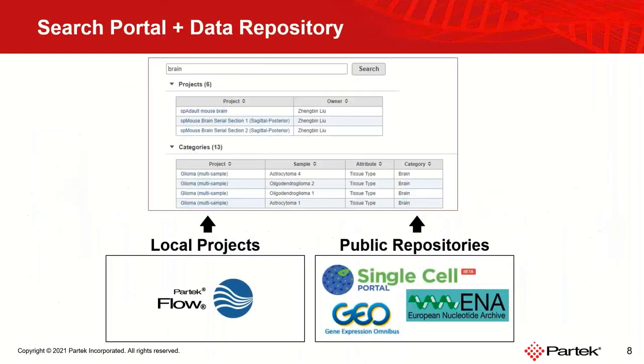A functionality that we recently added to Partek Flow is the search portal. It allows you to perform searches of either your own project database or of the datasets from public repositories, which we are adding to Partek Flow.